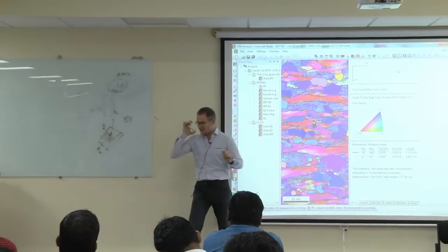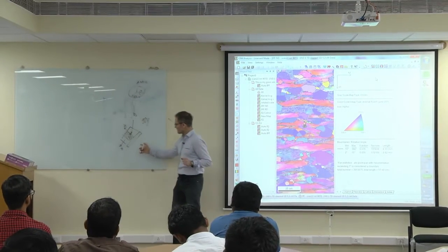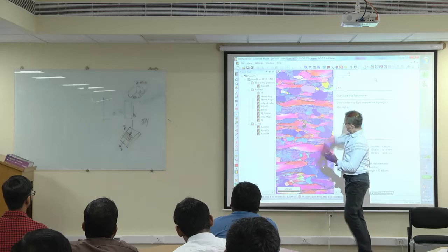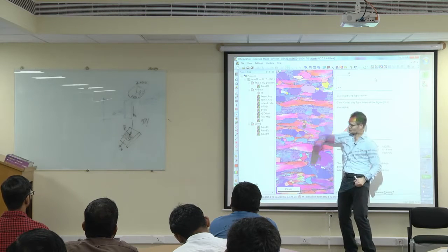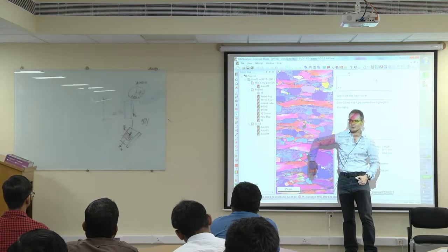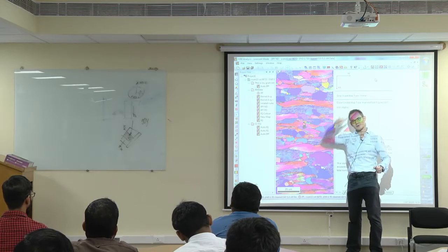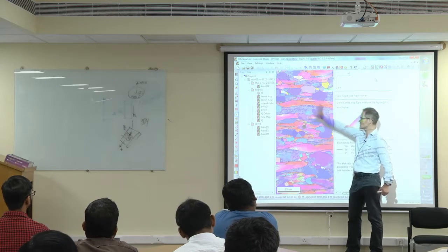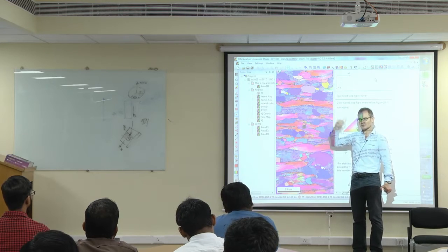And of course now, if you have done that, and you want now to measure, okay, so the colors are corresponding now to a coordinate system standing like that, no longer standing like that. The software doesn't know that internally, yeah? You have done this 90 degree rotation. You must keep it in mind, okay, this is all rotated.